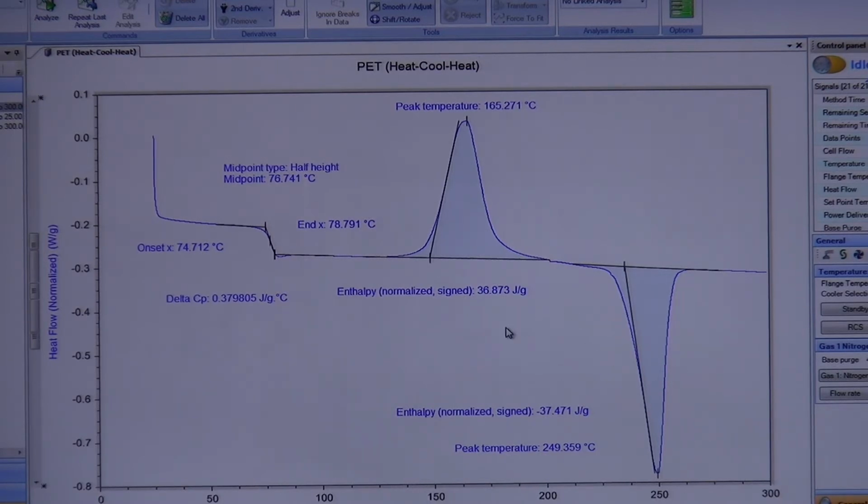a polymer like this. Now, if your polymer's enthalpy is extremely small, maybe 50 or something like that, now 1 joule per gram means a lot more, right? So you have to be mindful of where you are with respect to the enthalpy of fusion of the material that you're testing, okay? But that is how you would calculate the actual crystallinity: you divide the sum of these numbers by the enthalpy of fusion and times 100, and that would give you your percentage crystallinity, okay?